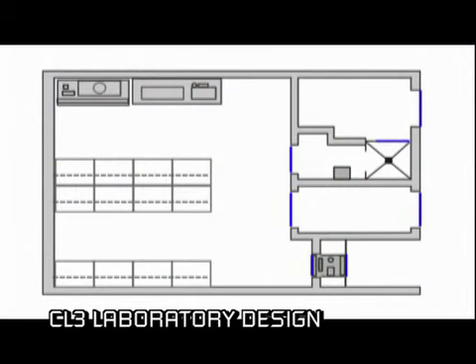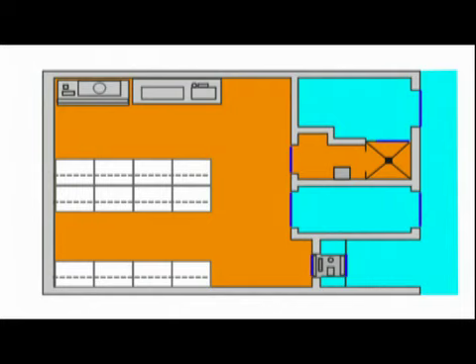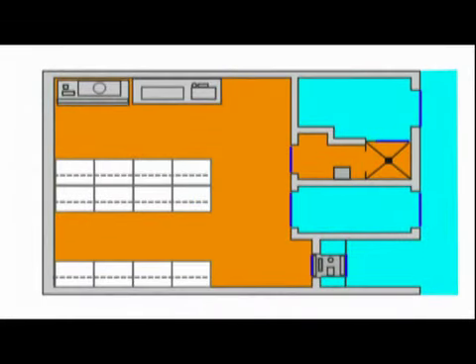A Containment Level 3 lab has a clean side and a dirty side. The objective of Containment Level 3 facilities is to minimize the release of infectious aerosols from the laboratory. The main point to remember about physical barriers in a Containment Level 3 lab is that no two doors should ever open at once. To ensure this doesn't happen, these doors have an interlock system or appropriate standard operating procedure in place. As each facility's design differs, entering your Containment Level 3 facility should be the subject of a detailed standard operating procedure specific to your facility.